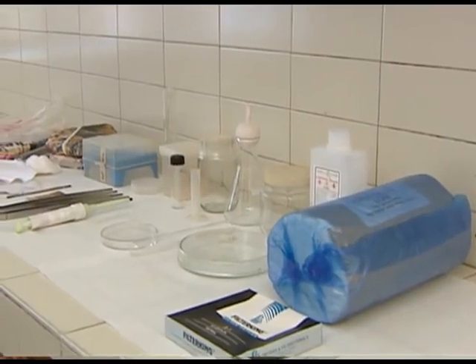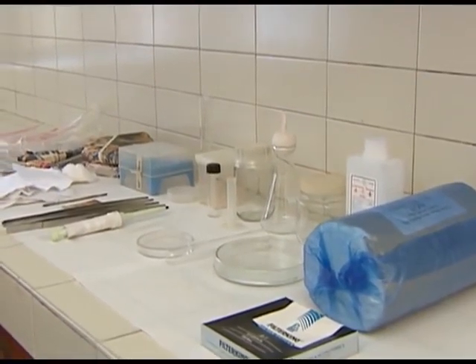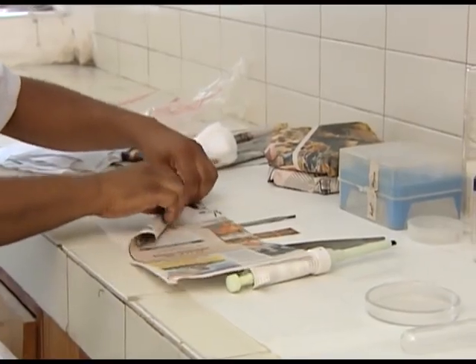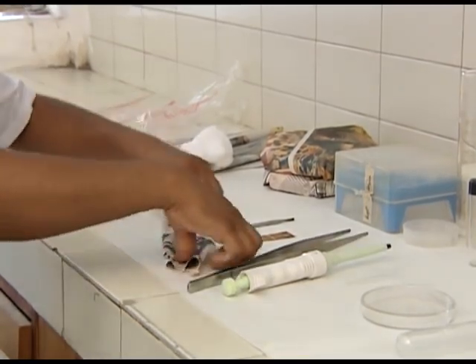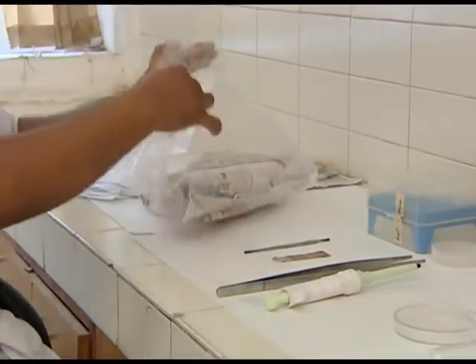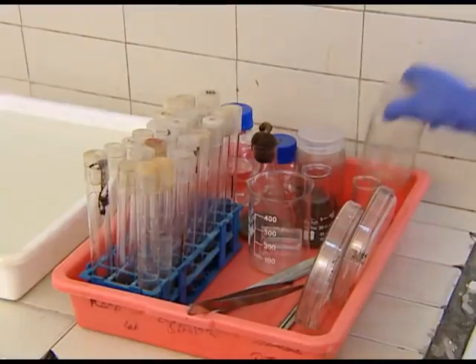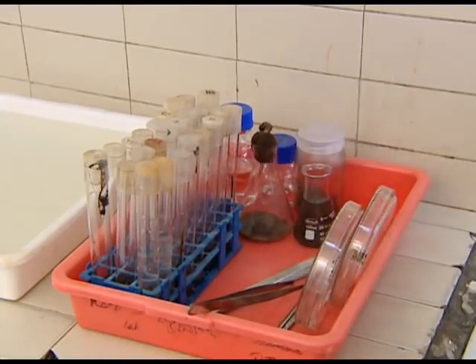First of all, it is important to take all the required apparatus in a spotlessly clean condition. These items are then wrapped in newspaper or brown paper with a knot at the side that has to be held by hand. These are then kept ready for autoclaving. Before performing a plant tissue culture experiment, it is required to have clean and sterile culture vessels.